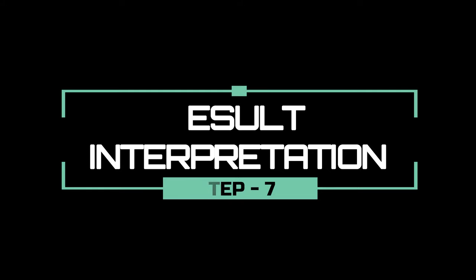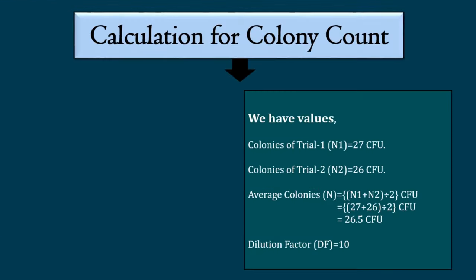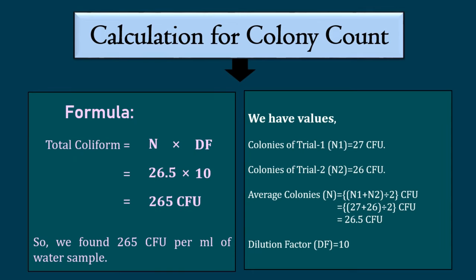Now we have to calculate the total coliform count of our sample. We found 27 colonies in trial 1 and 26 colonies in trial 2. On average, the count is 26.5. We diluted our sample 10 times, that's why the dilution factor is 10. Let's put the values in the formula given on the left side. So, the total coliform count of our sample is 265 CFU per ml.